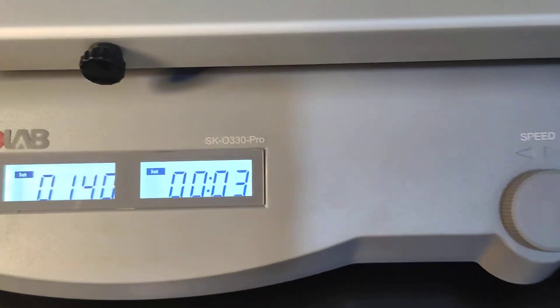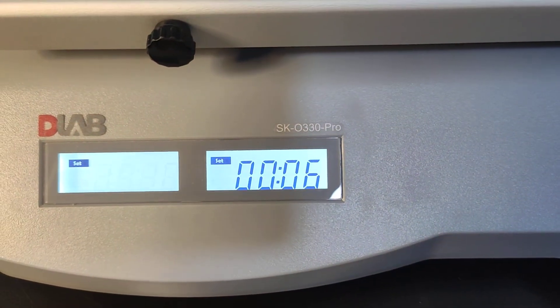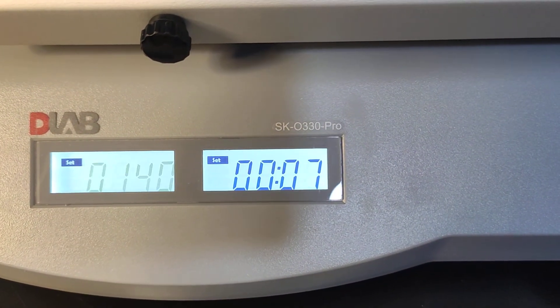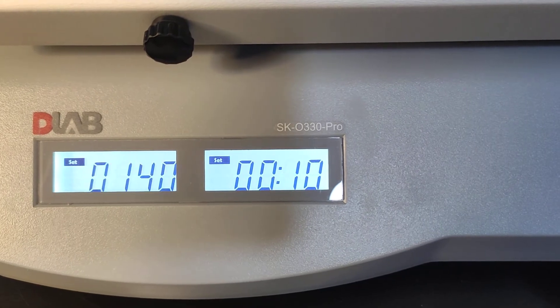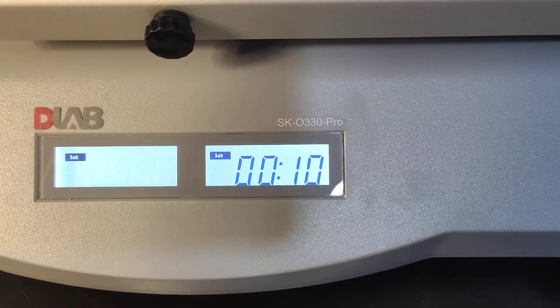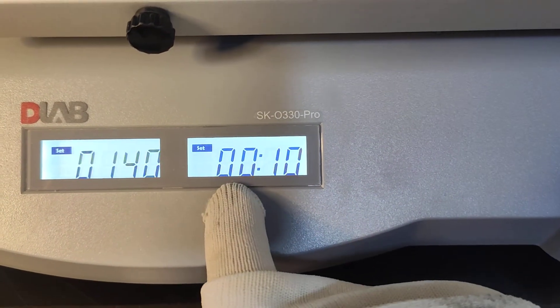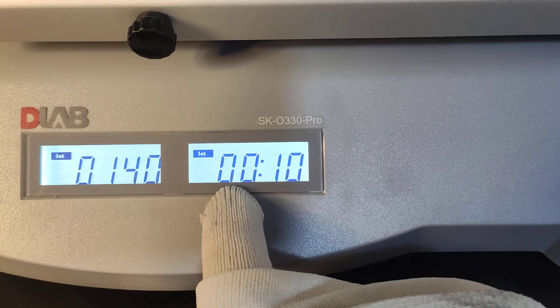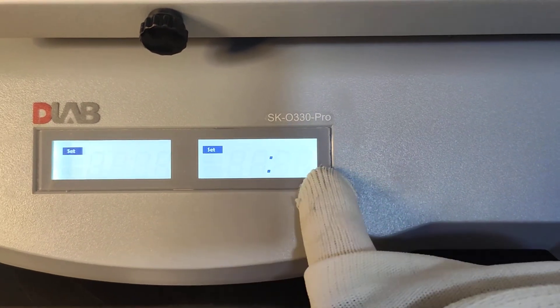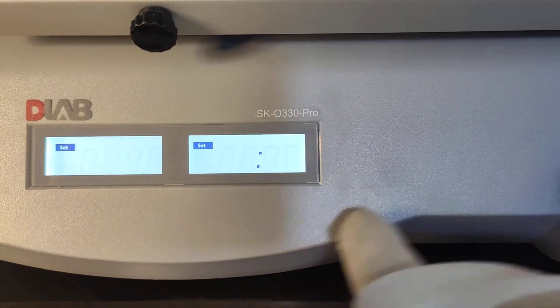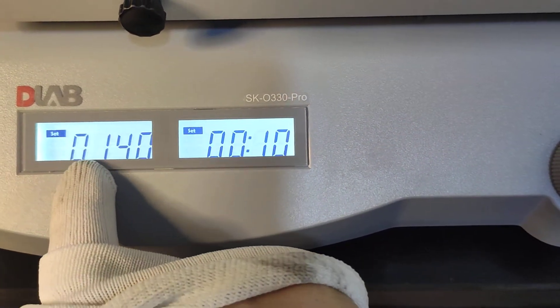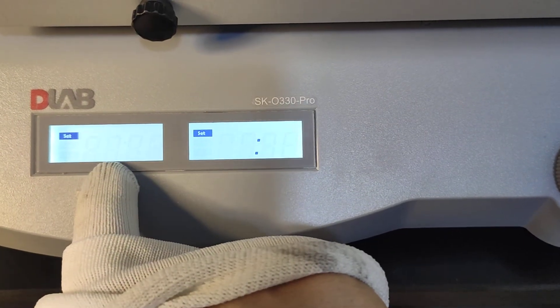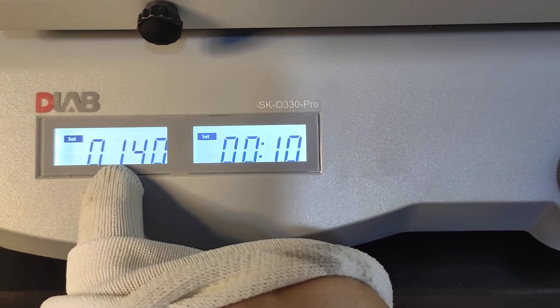This is the unit for the time is a minute, 7 minute, 8 minute, 10 minute. And this side is the hour. And for the shaking speed, the unit is RPM.